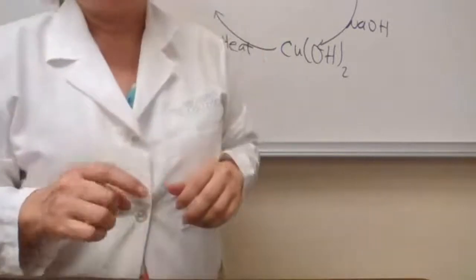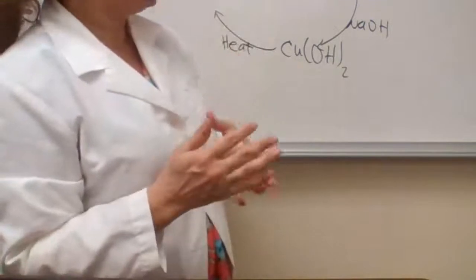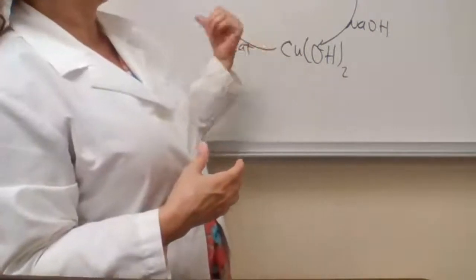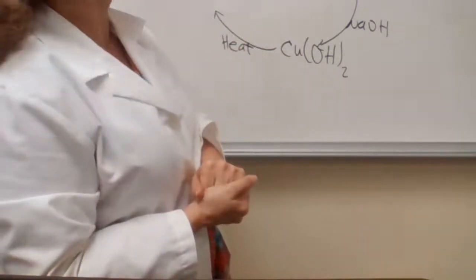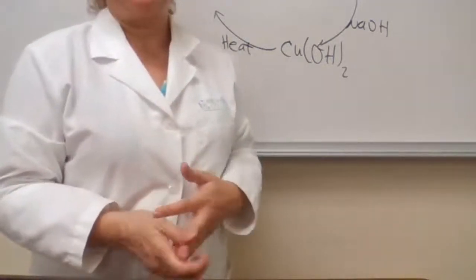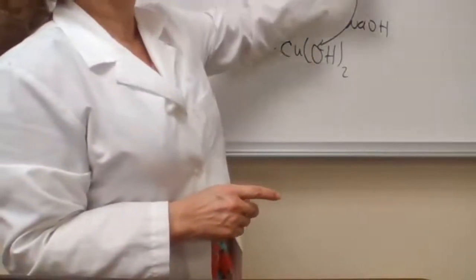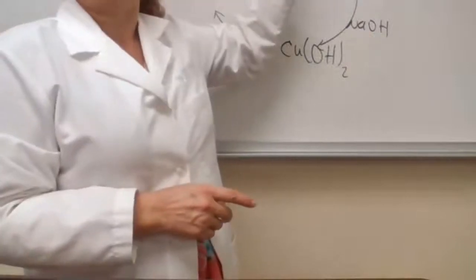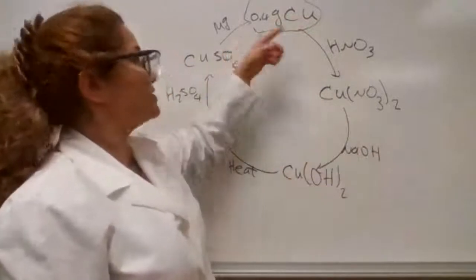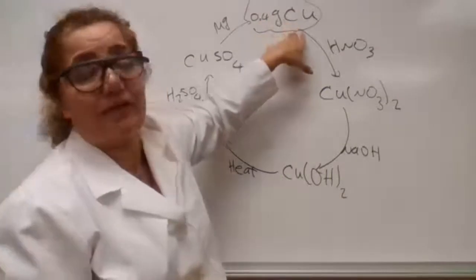So we are going to learn how to heat up the reaction mixture. We are going to learn about decanting. We learn about gravity filtration. We are going to study the law of conservation of mass. Ideally, if you start with 0.4 grams of copper, after you cycle the copper through all of these reactions, at the end, you're expected to get 0.4 grams of copper.